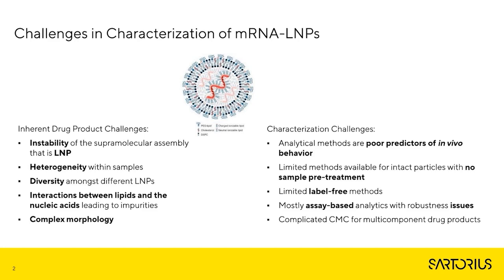So that's why I'm saying here that for intact particles, there are very limited options on how to analyze them without any pretreatment or any labeling, because labeling is a very powerful tool on each level, whether you have the particles formed before, or just for labeling RNA. There are many different ways to label your species, especially with fluorescence, because it's very specific and very powerful. But we have to realize that all of that changes the system a little bit.